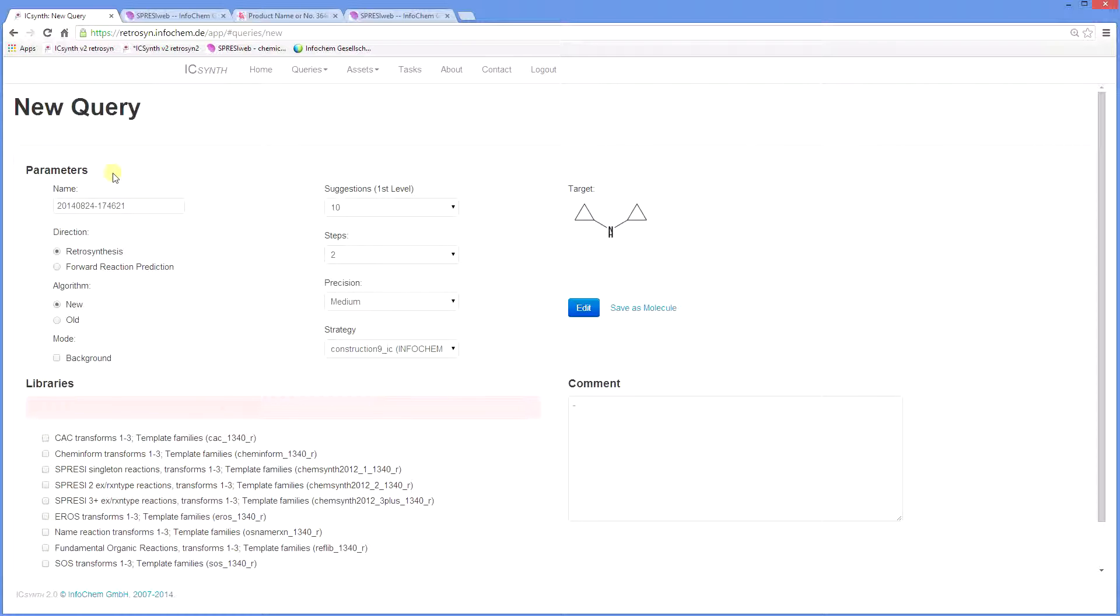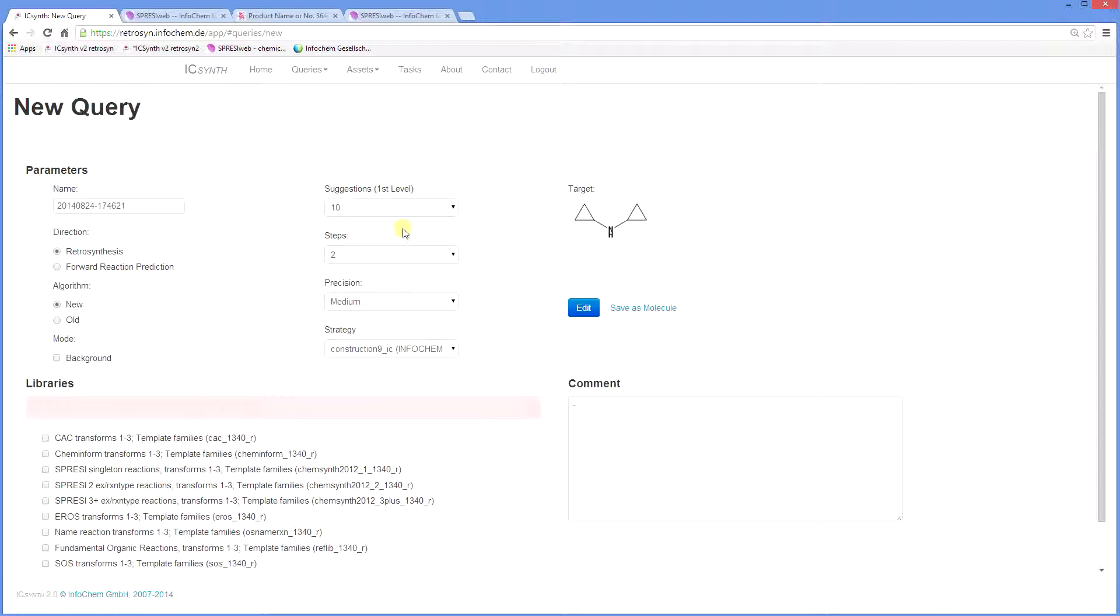Click on OK and return to the query menu. The default direction is Retrosynthesis. Forward reaction prediction for reactivity mapping is the subject of another tutorial. The number of first level suggestions is set at 10. This controls the number of precursors you see for the target molecule at a given level, or the breadth of the synthesis tree.